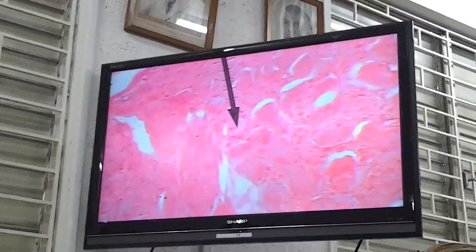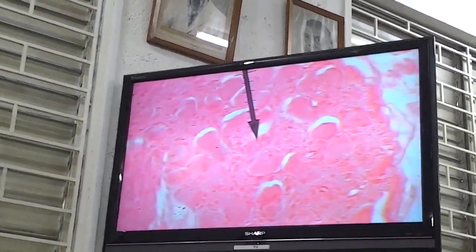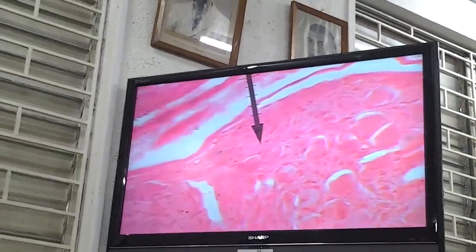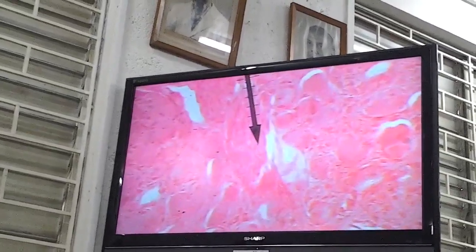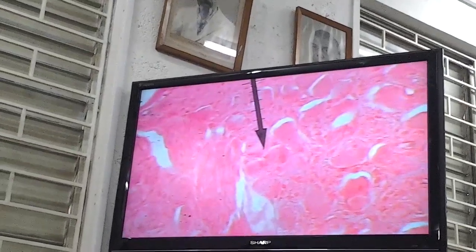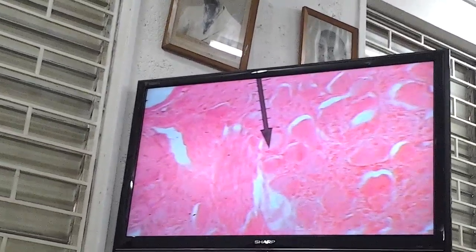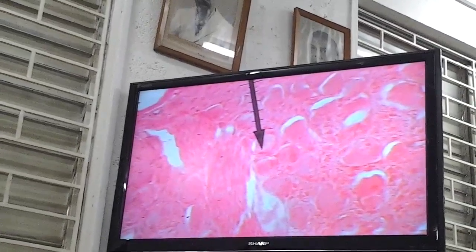These are very, very distinctive nuclei of the post-ganglionic cell body, and the cells are very, very nice here. These flattened satellite cells that surround the cell bodies of the neuron. There's a good one right here, right there. See, there. So this is beautiful. You can see the flattened cell there, and that basically will be the satellite cells. Okay? So you get a good look at it.